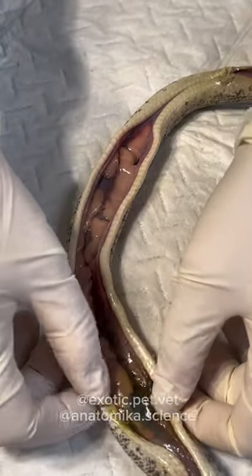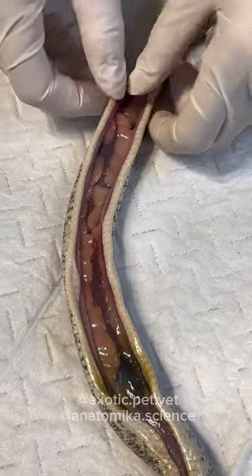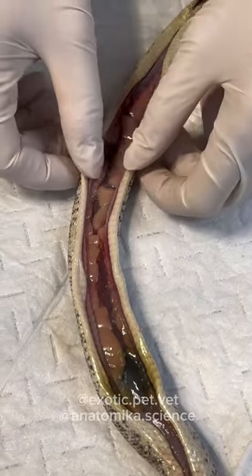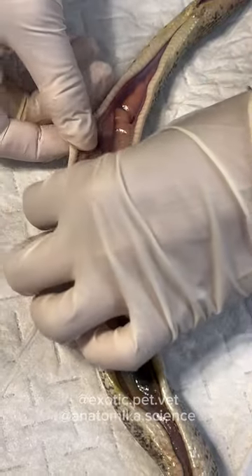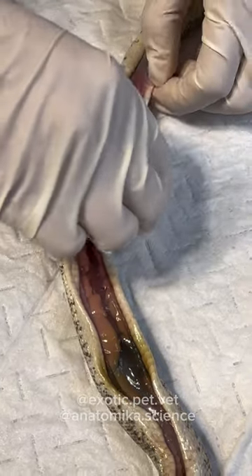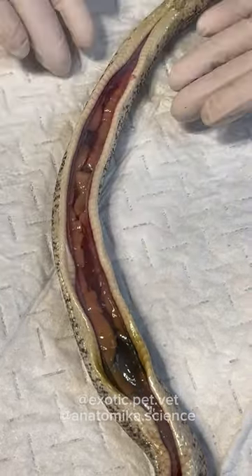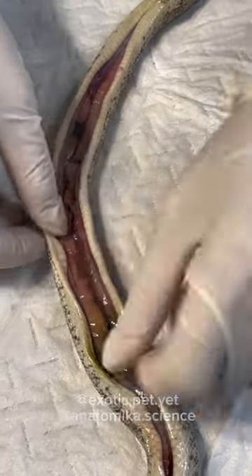Where are the testes in these guys? It's usually a little bit more cranial than the kidneys. For snake necropsies, what you can do is pull the skin away from the body and then kind of roll the edge — and then you can have a nice view of all the organs. I never learned that trick on my pathology rotation. That makes it look so nice.